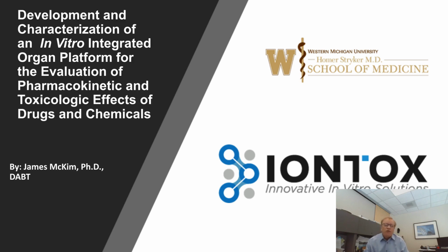And I'm looking forward to talking to you today about the work and the progress that we've made on in vitro platforms that allow integrating organs through simulated blood systems. And so I'm going to be talking to you about that platform that was developed here at IONTOX for understanding pharmacokinetic and toxicologic effects of drugs and chemicals.